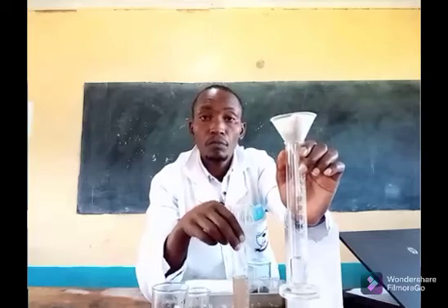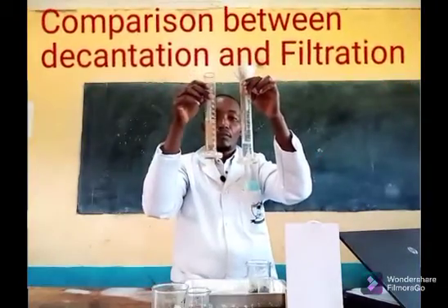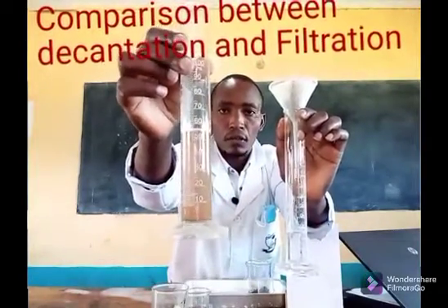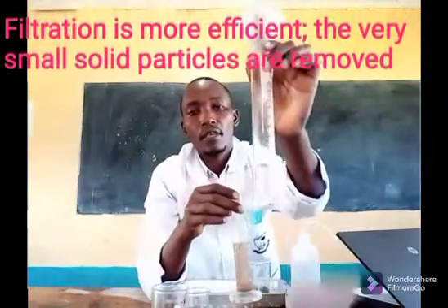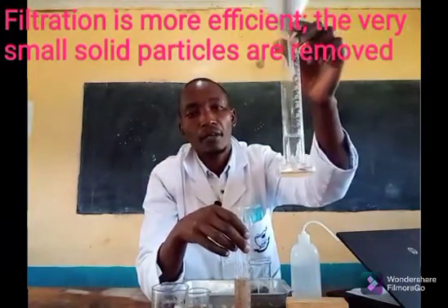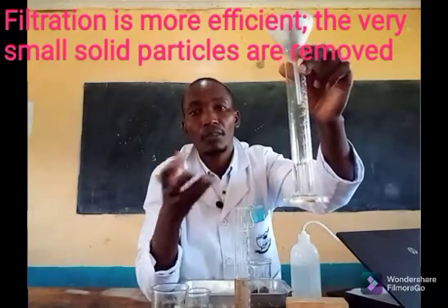So what do we need to do? Compare the two. This is with decantation. The very small solid particles remained in the liquid I've decanted. Over here, the solid particles, however small they were, even the microscopic ones, have been trapped.